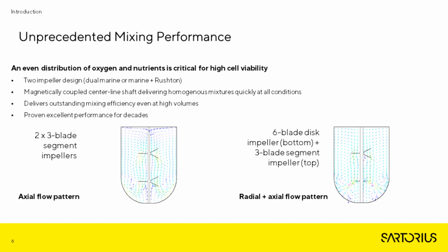Compared to the stirred bioreactor and the technology there, as I explained already, the motion is introduced by the wave. Here, in contrast, we do have active stirring and we do have active gassing, and that's the classical conventional stirred tank bioreactor design. We have those blades which help ensure that the nutrients, the cell culture media, and the cells themselves are distributed homogeneously. And also the gas is provided into the media actively due to the impellers.